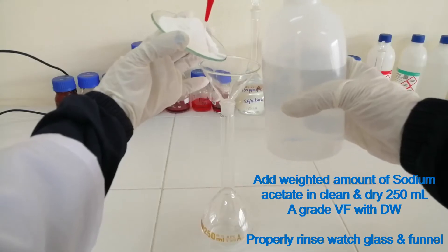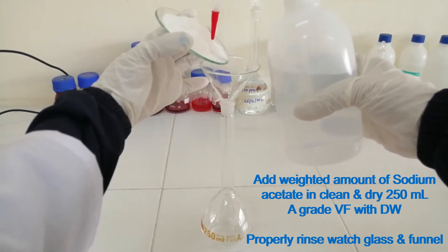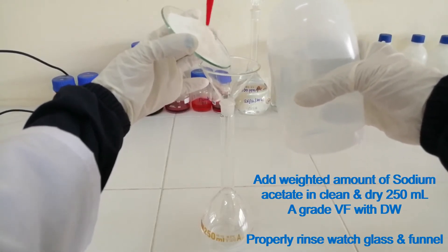Add the weighed amount of sodium acetate in a clean and dry 250 ml A-grade volumetric flask with distilled water. Properly rinse the wash glass and funnel.